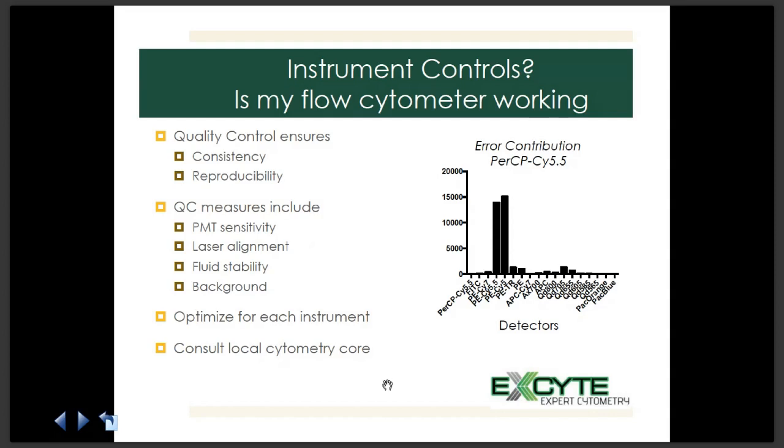I'll tell you, here at our facility, we dump everything into a database program that's automatically analyzing all of our QC data. And we have QC on every instrument that we've had in our facility and every PMT in our facility since we put this program in place in 2008. So that's almost 10 years worth of data. And I can tell you, if you give me a day of the week and ask for your machine, I'll tell you how well that machine was performing relative to its baseline. That gives the user base a level of confidence that the machines are working consistently and reproducibly.